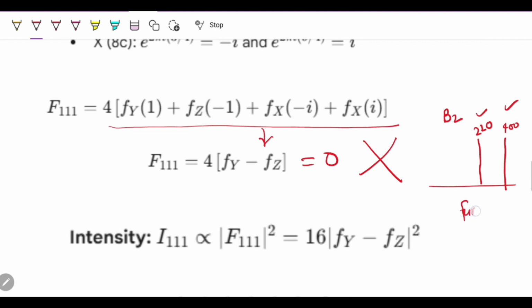So basically, these are the fundamental peaks in the Heusler alloy, while the 111 and 200 depend on the atomic ordering, or you can say additional atomic ordering. The structure is the same, FCC, but now they depend on the atomic ordering.